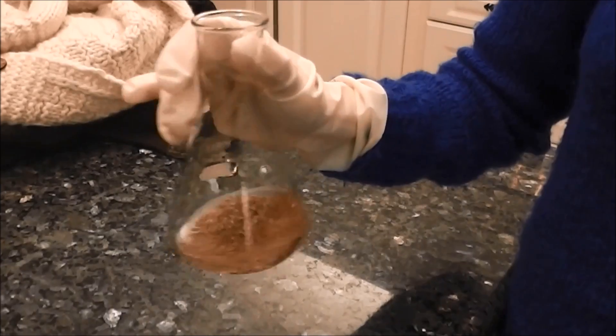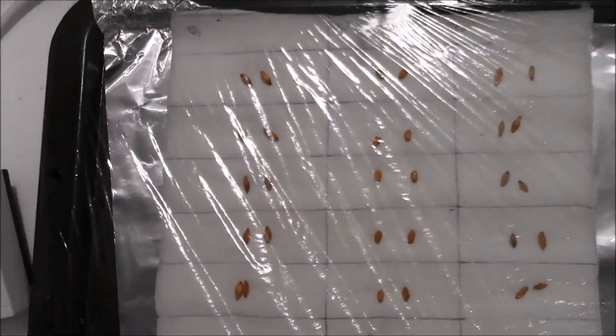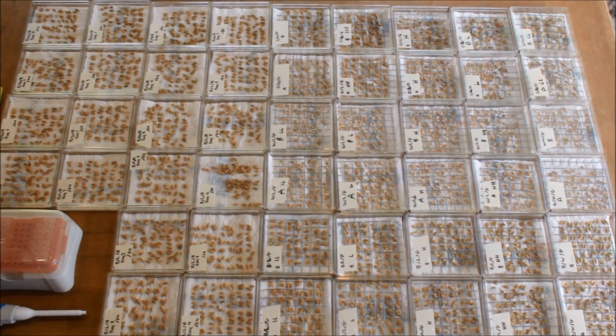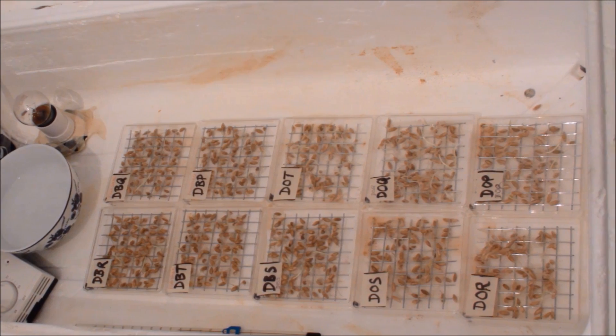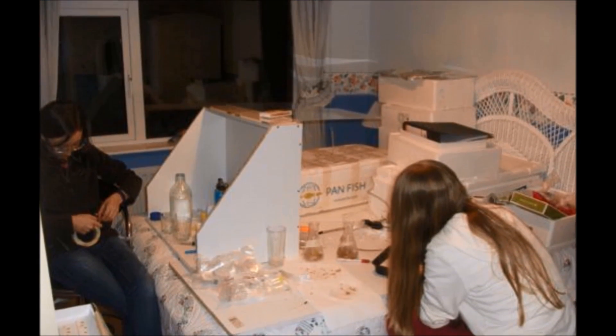We designed our experimental method and spent many hours sterilising seeds, making our bacterial solutions and inoculating our seeds. We placed our seeds in the incubators and they were checked every 6 hours to see if they had germinated, which meant getting up at 6am.